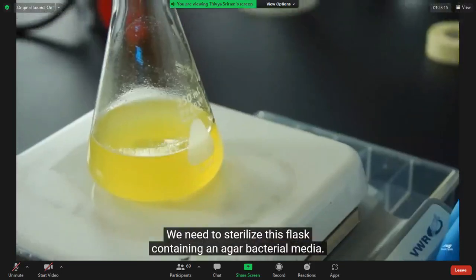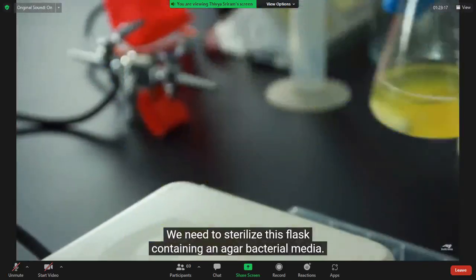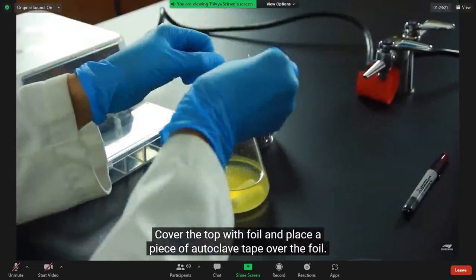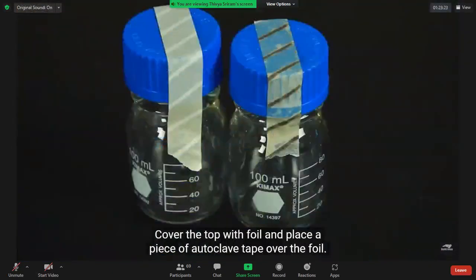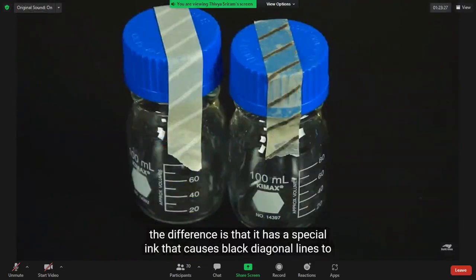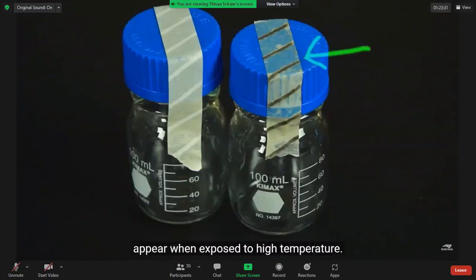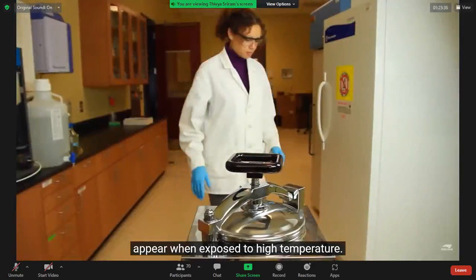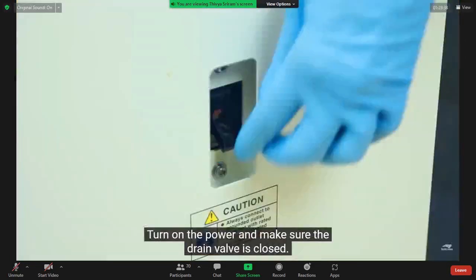We need to sterilize this flask containing an agar bacterial media. Cover the top with foil and place a piece of autoclave tape over the foil. Autoclave tape looks like regular masking tape. The difference is that it has a special ink that causes black diagonal lines to appear when exposed to high temperature. Turn on the power and make sure the drain valve is closed.